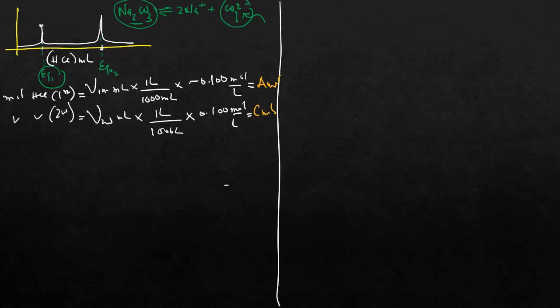Now looking at this, that is the carbonate ion. That is what actually is taking up your HCl. So plus HCl, or I prefer to just use H, so let me just use hydrogen.